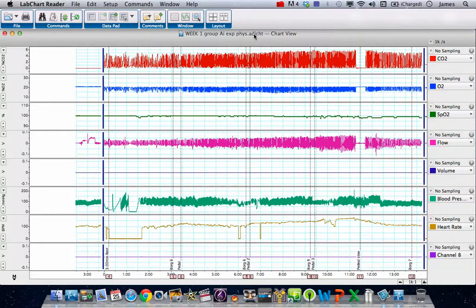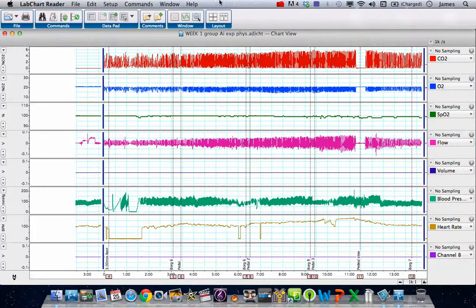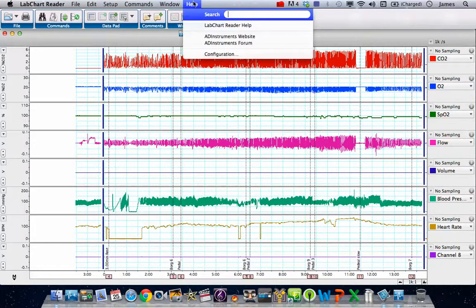Hi, it's Dr. Clark here. What we have on the screen in front of us is LabChart Reader on an Apple MacBook. This is the latest version of LabChart Reader.